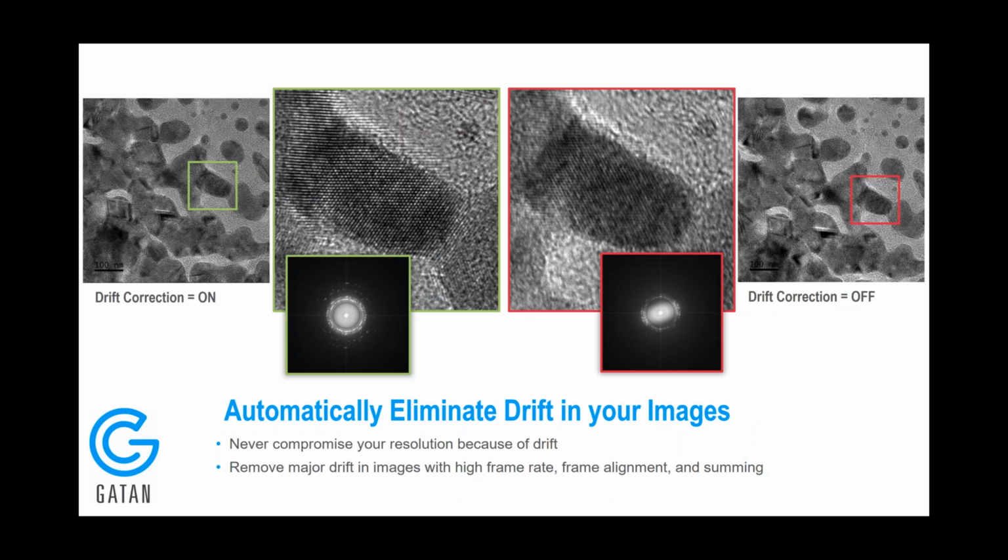The second point is that the rings on the left-hand side are mostly complete. So you see a complete circle, which means the camera is preserving information, and the image has information in all directions, while the FFT on the right-hand side is not like that.